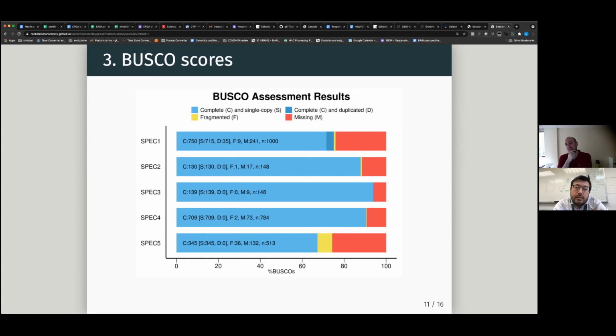But no, I mean, birds are good. Birds are considered the easiest vertebrates on average to assemble. Small genome, not a lot of repeats, relatively simple to assemble. Yeah, you can assemble a bird genome within 3 hours. So that's great news. But if you want to assemble a lot of them, let us know.